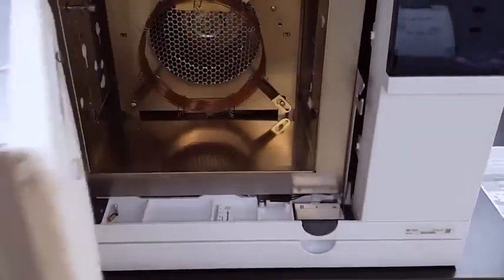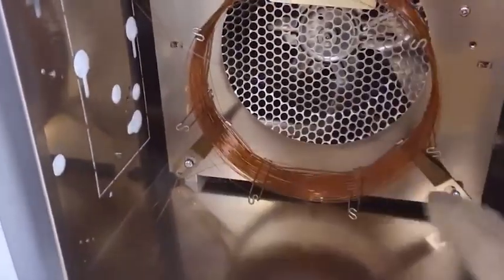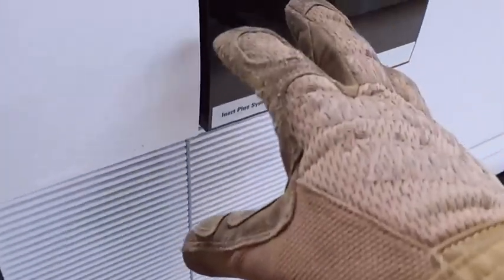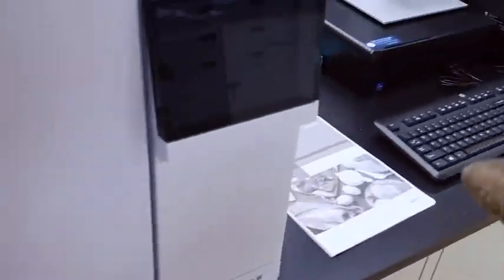That is the GC column right there — I think that's 60 meters in length. The sample gets put into this inlet and it goes through this column. There's a temperature gradient, and then after it goes out — which is here — it goes into the mass spec side of this instrument, which is over here. This does the mass spectrometry and then you get results on your computer.